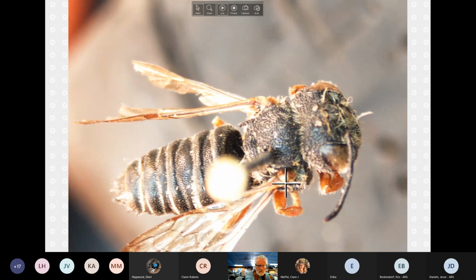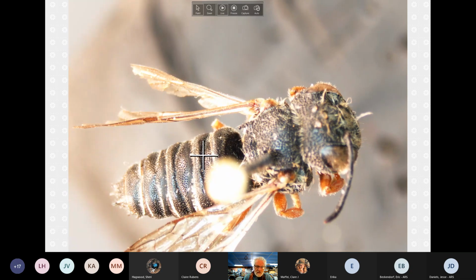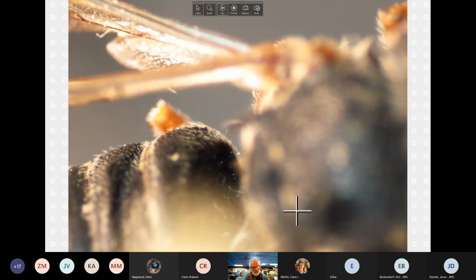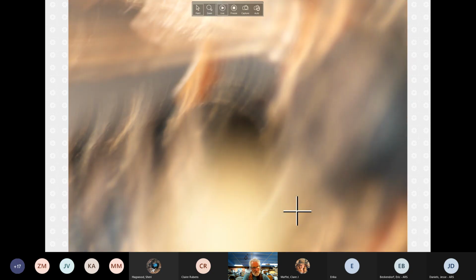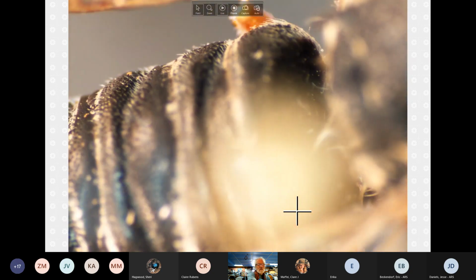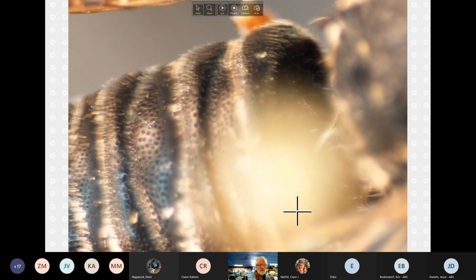Okay, so we'll start at the high view. So you can see, indeed, this specimen has redder legs than the other one. But like I said, there are exceptions, but this could be a hint that maybe you should think on the octodentatus side of things.